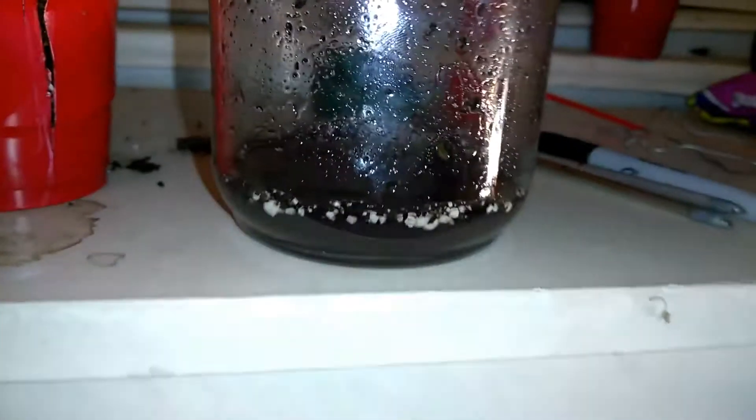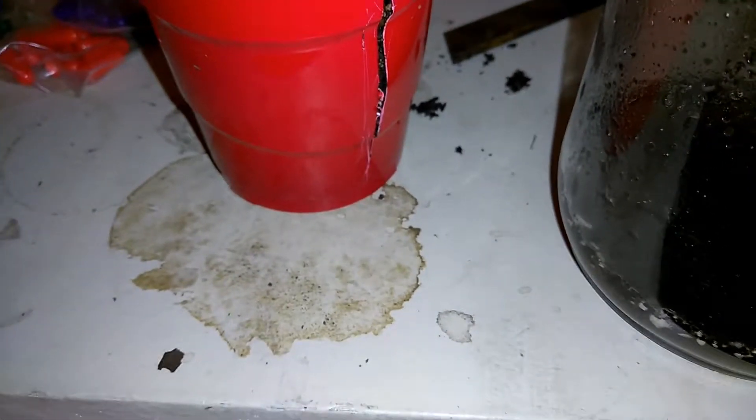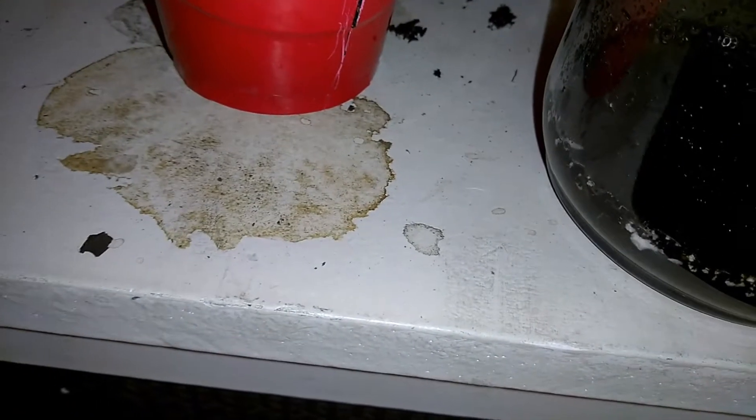Once you've shaken it, you want to let it settle for about a minute or two. If your soil is more clay based — which it shouldn't be if you're growing cannabis — you're going to want to wait longer.